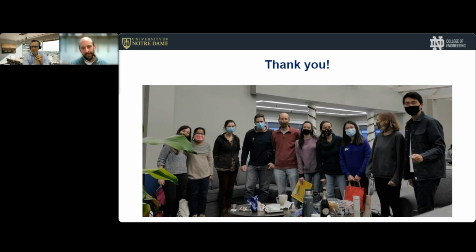But it would be interesting to see if there are other ways to use OCT. It's possible that you could use some kind of a FISH type stain, something that would make the cells more opaque when it hybridizes either to the cell surface or to the interior, that would allow you to visualize that with the OCT. But again, we haven't looked into that, but it'd be really nice if that were possible.